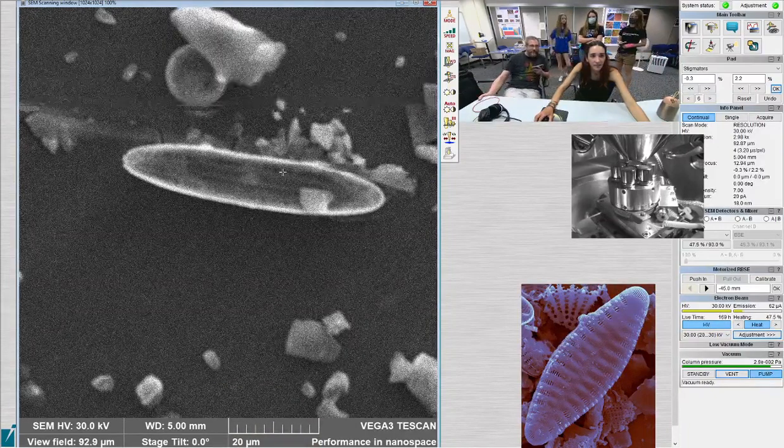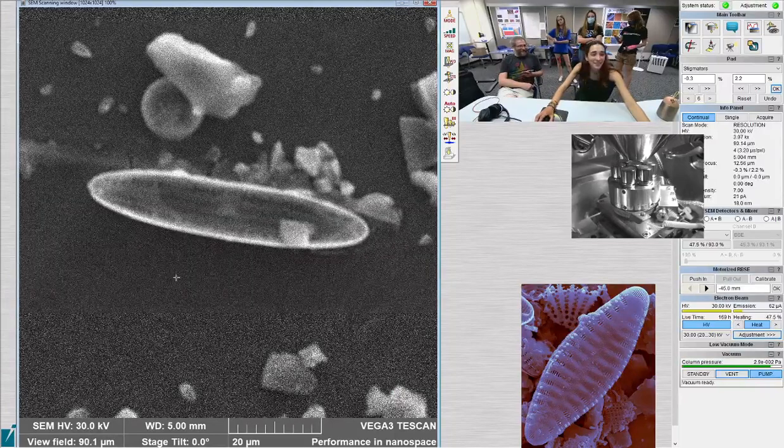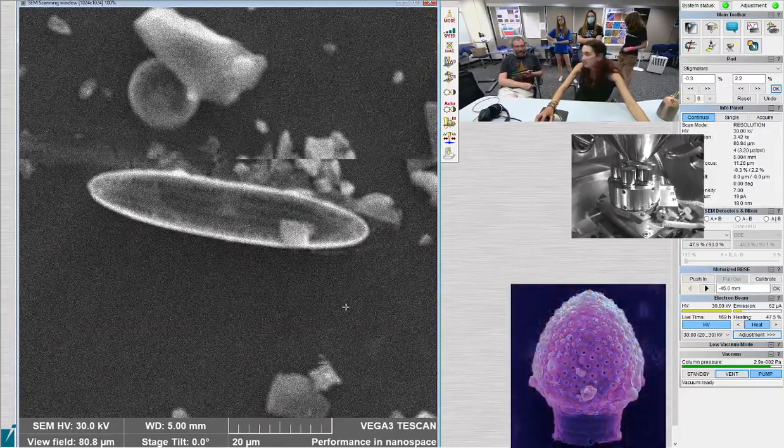Oh, what's this? Where did you find us? I'm guessing some sort of pinellaria, but I have to. And there's a baby one.